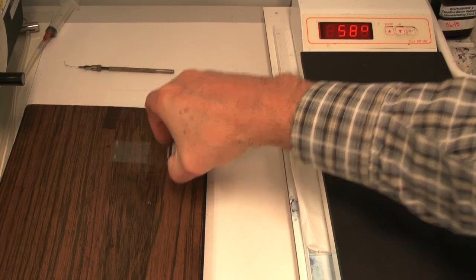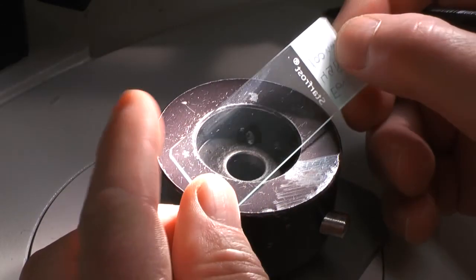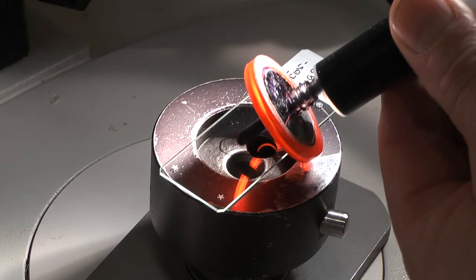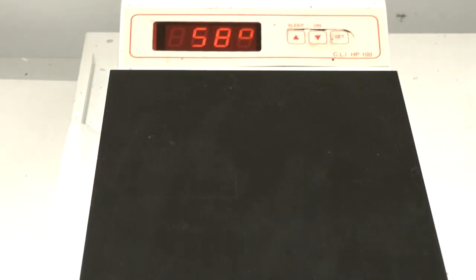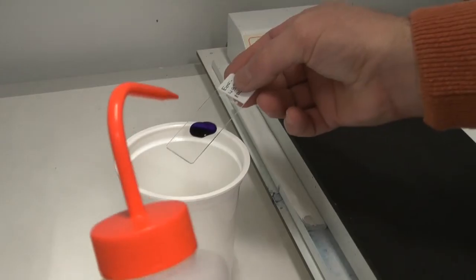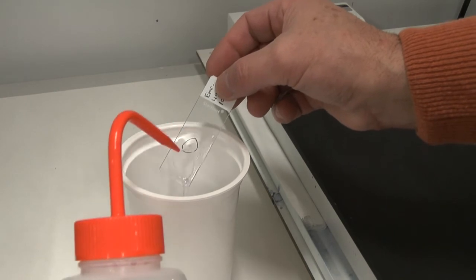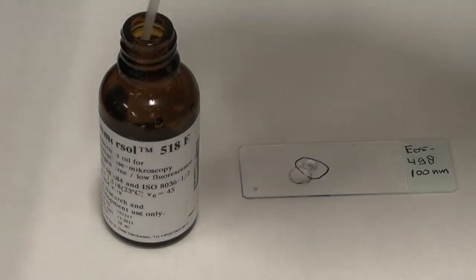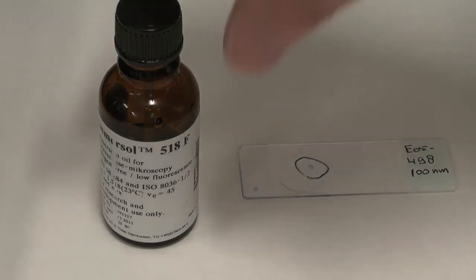The section is dried on a hot plate. Sections are encircled with water-resistant ink on the reverse side of the slide. Sections for morphology interpretation are counterstained with light green, toluidine blue or acridine orange. Rinse the excess stain with distilled water and dry on a hot plate. Immersion oil can be used as mounting medium. The slide will be covered with a clean cover slip.